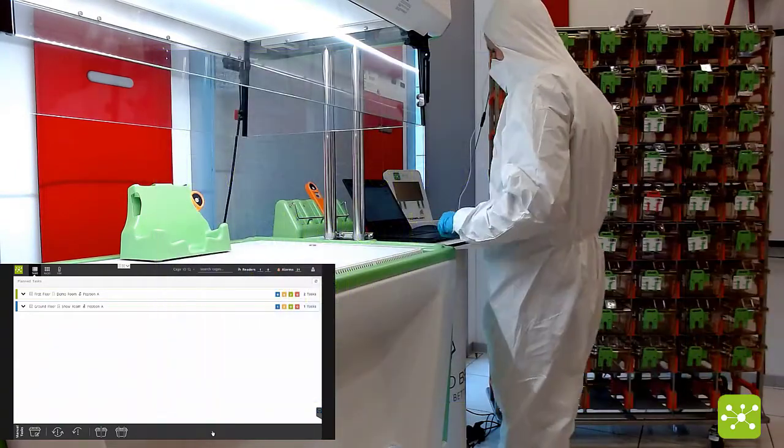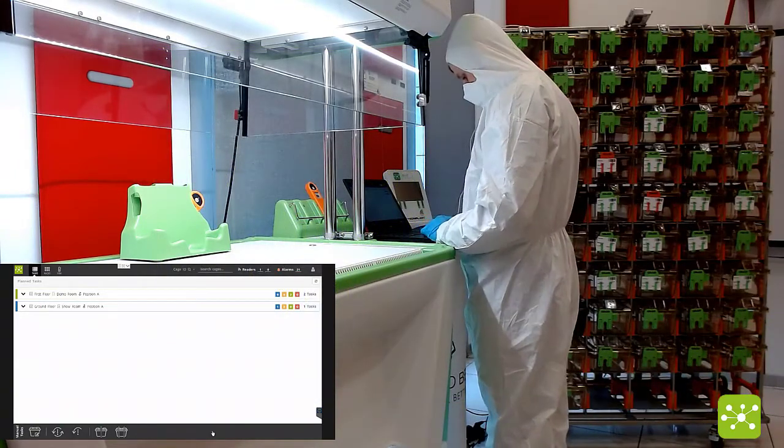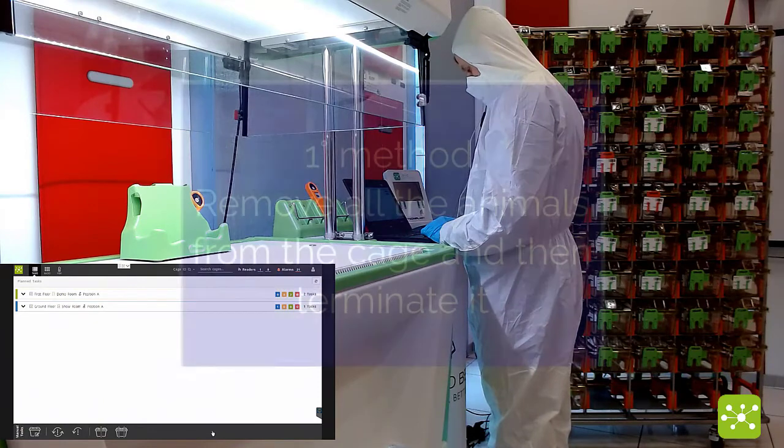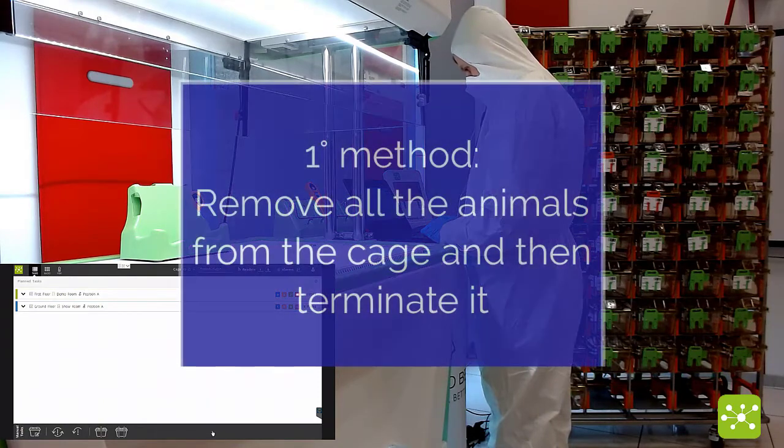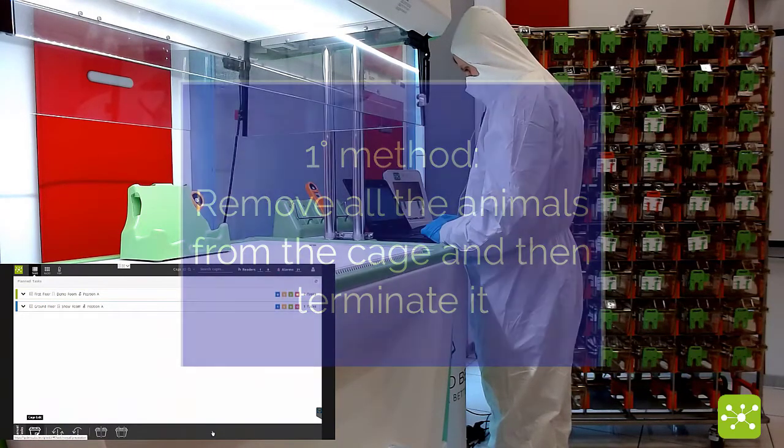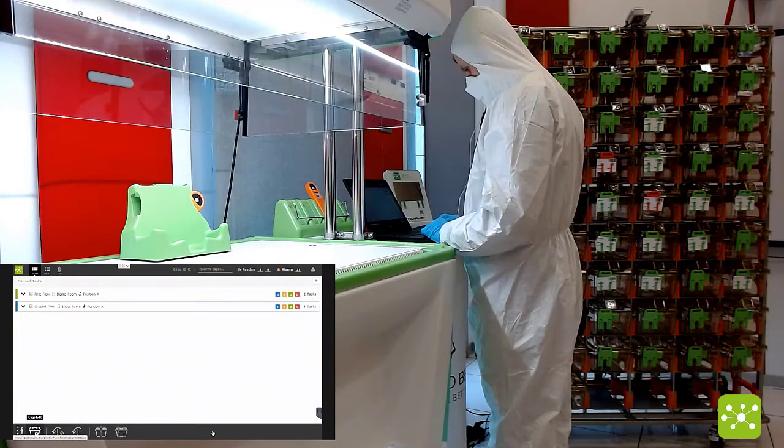The first way is related to the fact that you can eliminate or cull an animal from an already registered cage.